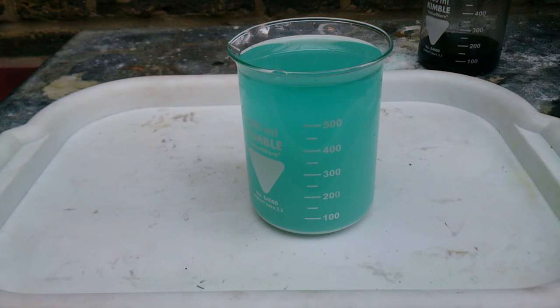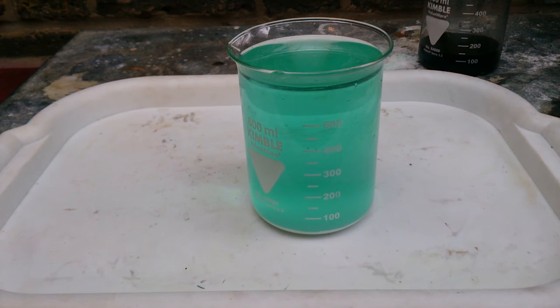To be honest, this kind of reaction is quite similar to precipitation of silver chloride. The only trouble is silver chloride does not dissolve well even in concentrated hydrochloric acid. The chances are it will precipitate long before you dilute your solution to such extent. If you do see precipitation, most likely it's not silver chloride, but copper chloride 1.